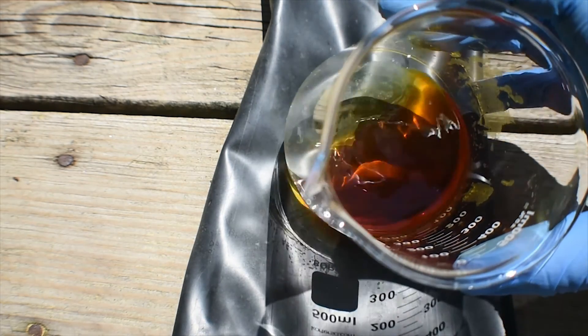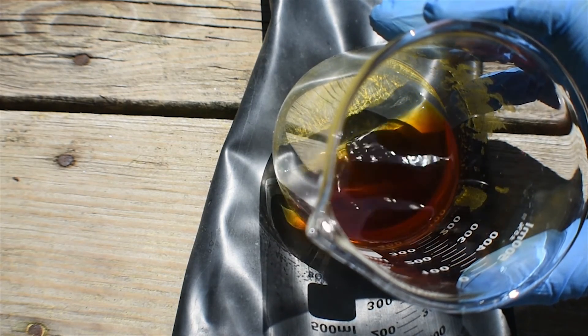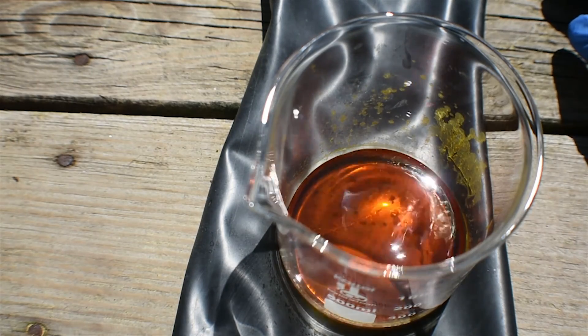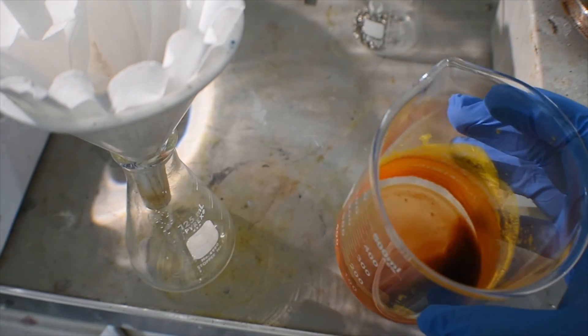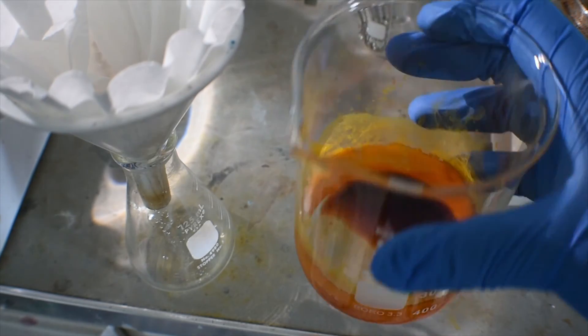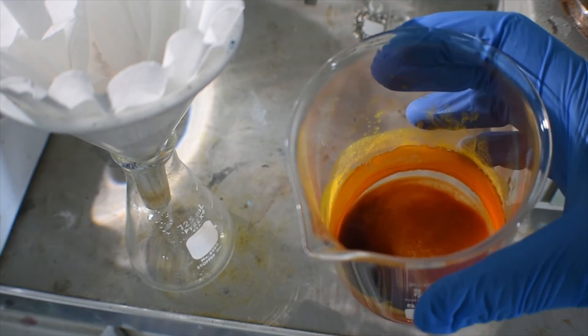If we tip the beaker up a little bit, we will be able to see the stannic iodide crystallize out as the chloroform evaporates. As more chloroform evaporates off, more will crystallize out from solution. Under the dark chloroform layer, we have this nice bright orange powder. All we have to do now is filter this off and the chloroform will evaporate, and we're left with a dry powder. I'll try to do this quickly to minimize any hydrolysis of the product from atmospheric moisture.